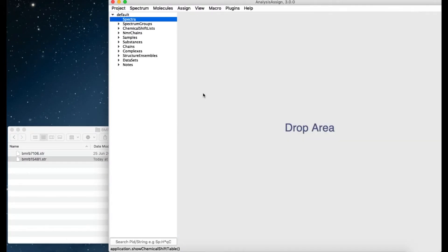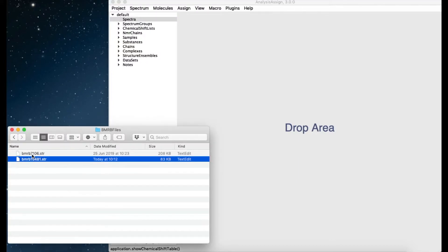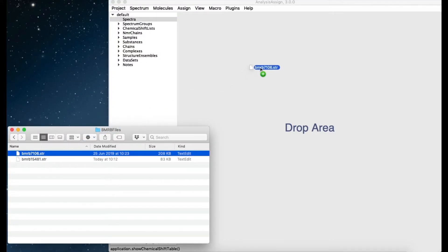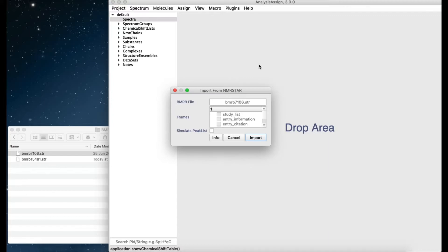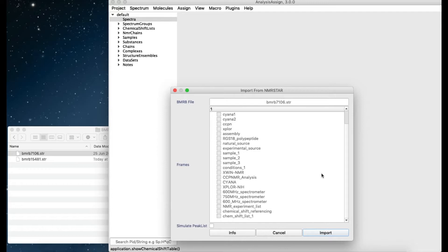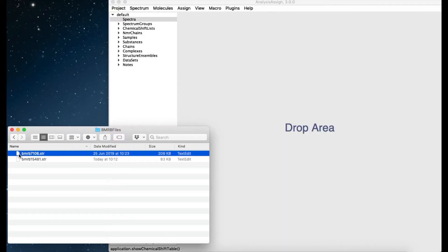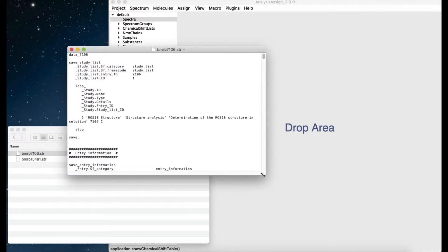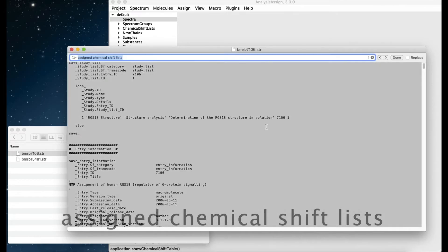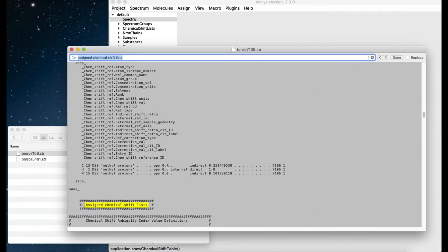Sometimes you may find that your BMRB import doesn't work because some BMRB files are still in the 3.1 rather than the 3.2 NMR star format. In this case you won't get an Assigned Chemical Shift List with a little tick. A small manual adjustment can get over this problem. Simply open your BMRB file as a text file and search for the string Assigned Chemical Shift List, which will take you to the right section of the file.